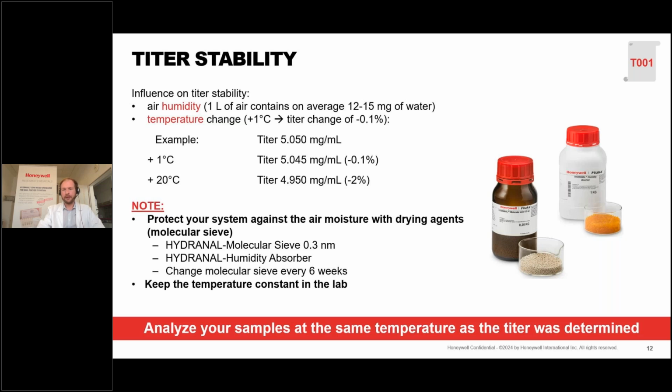Furthermore, temperature also has an influence on the titer value, because the titer value is given as a function of a volume, so it's given in milligram per milliliter.